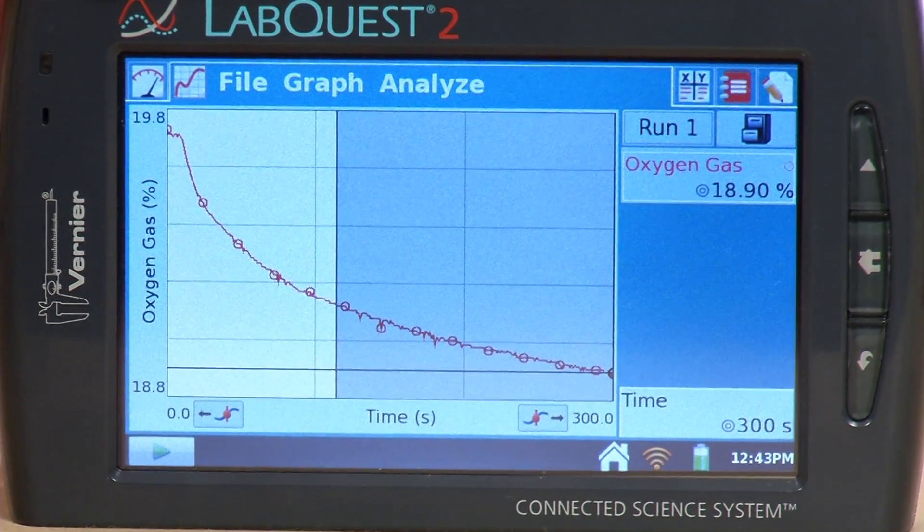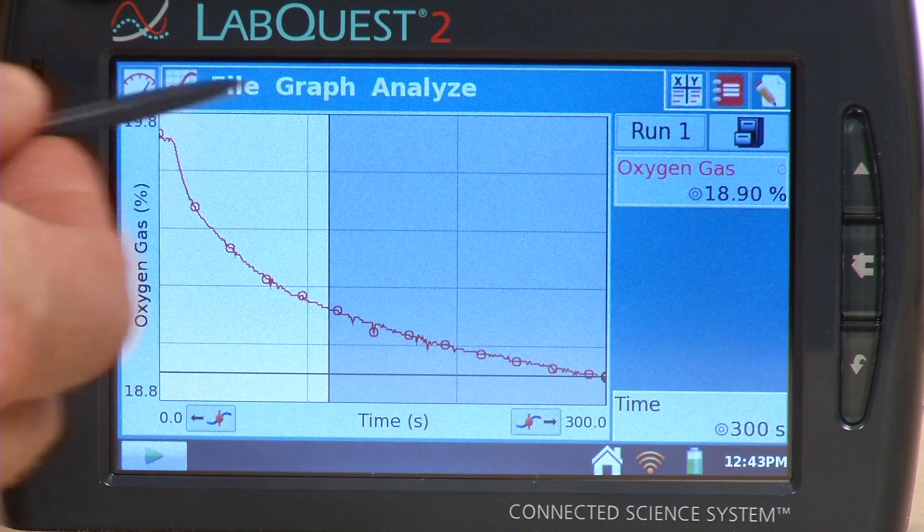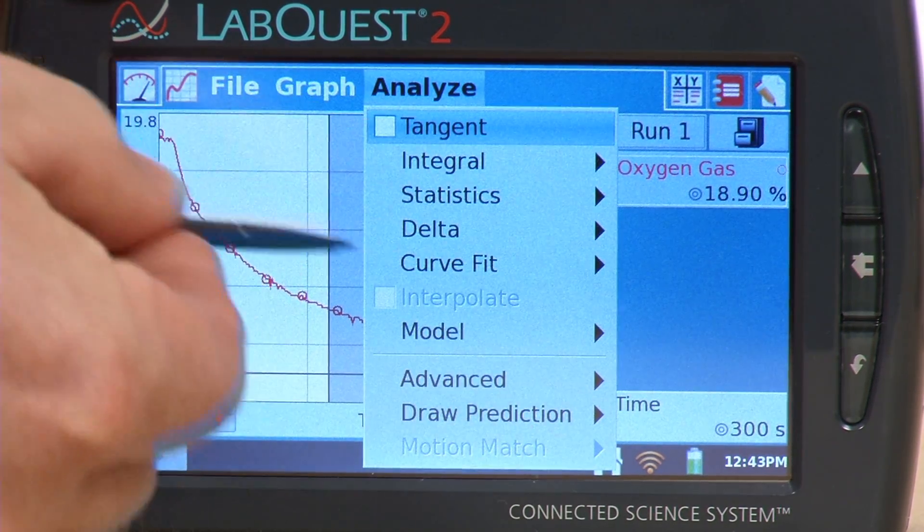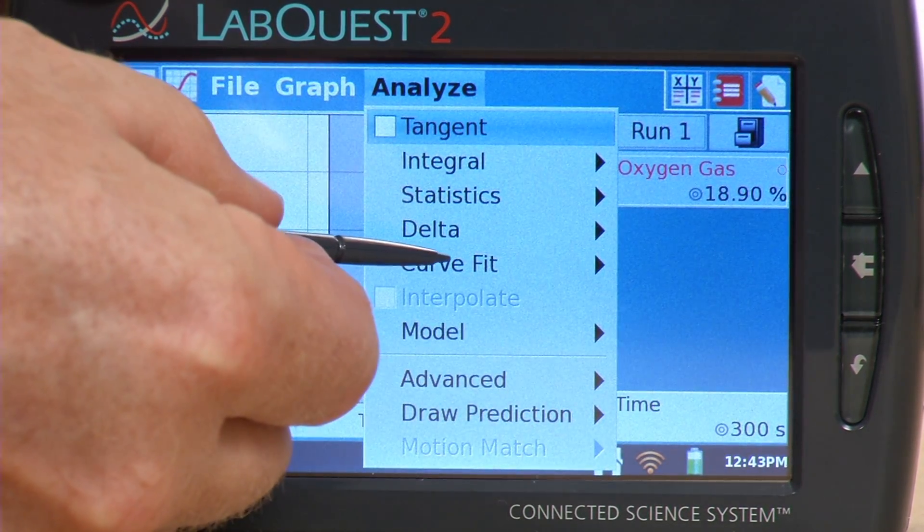And so I'm highlighting just that region of the graph. And that way when I do the curve fit, it will use just those data to calculate that. So I'll do Curve Fit.